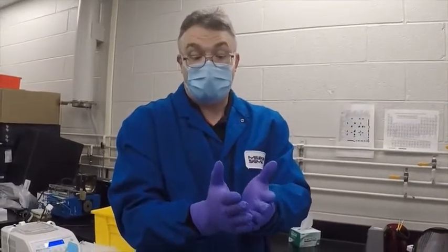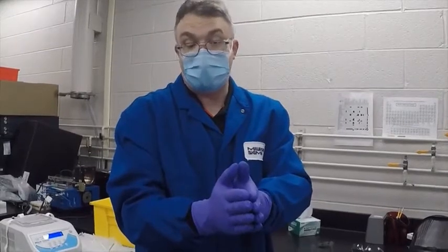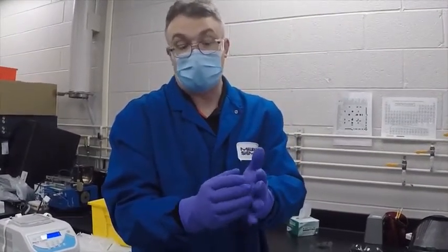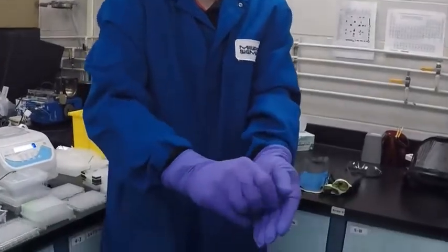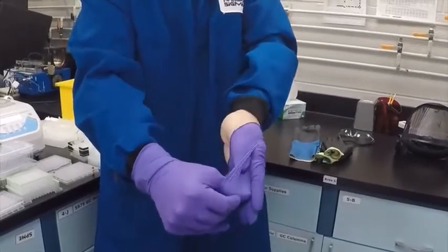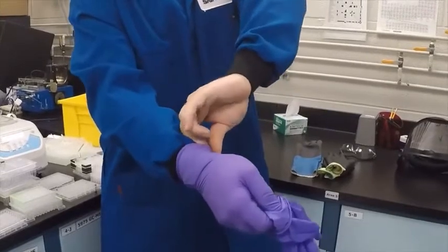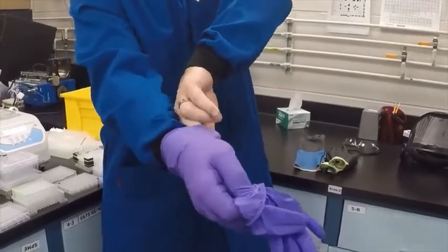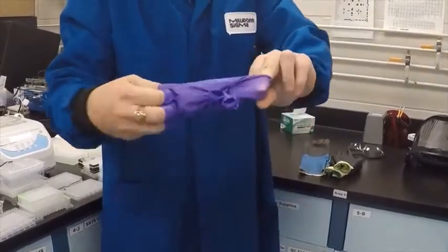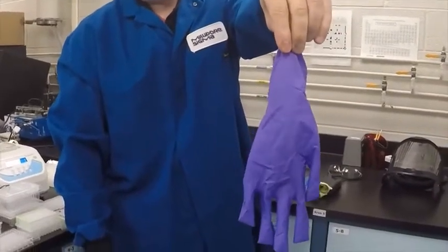Now once the gloves are contaminated, doffing the gloves is a little more critical. You don't want to get your hands contaminated while taking your gloves off. To properly remove your chemical gloves when they're soiled, grab the palm and carefully pull the glove off your hand. Once that hand is free, go in behind the other glove, pull both gloves inside out, and you can safely dispose of them in your waste container.